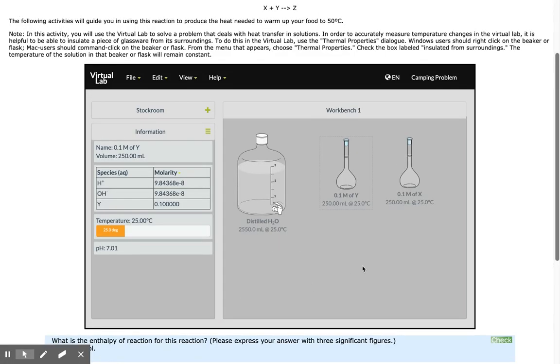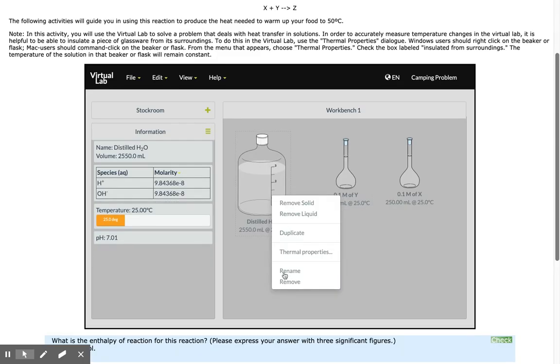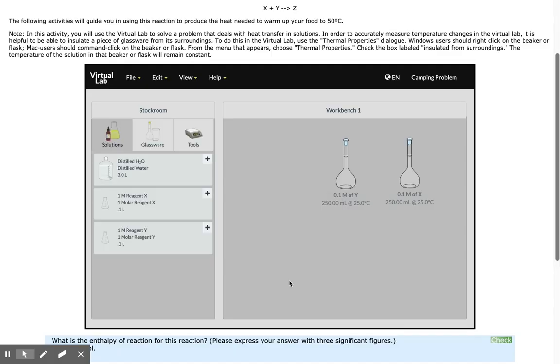You can see I now have another volumetric flask with 0.1 molar of Y. This is also 250 milliliters. I'm done with the distilled water, so I can remove that from the desktop.